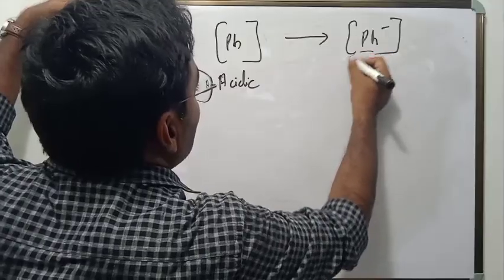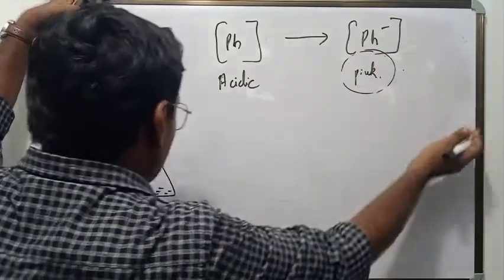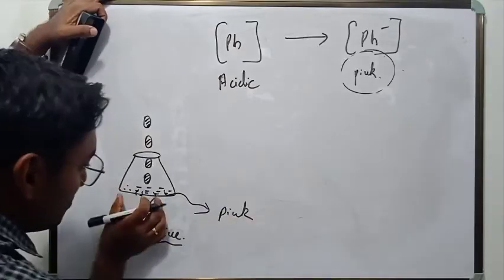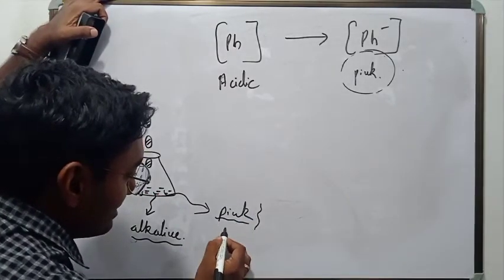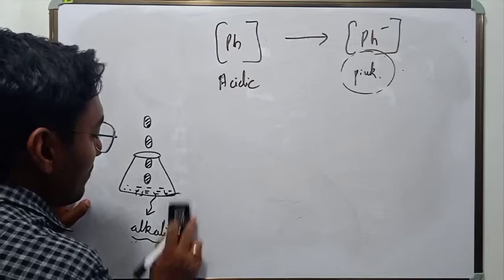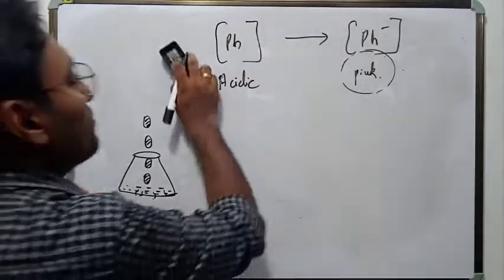So because ionized phenolphthalein becomes pink in color in basic media, the whole solution here becomes pink in color, because the whole solution is basic. So now because phenolphthalein has ionized and it's pink in color, the whole solution becomes pink. So when you get that pale pink color, what do you infer? What do you conclude? What is the conclusion?